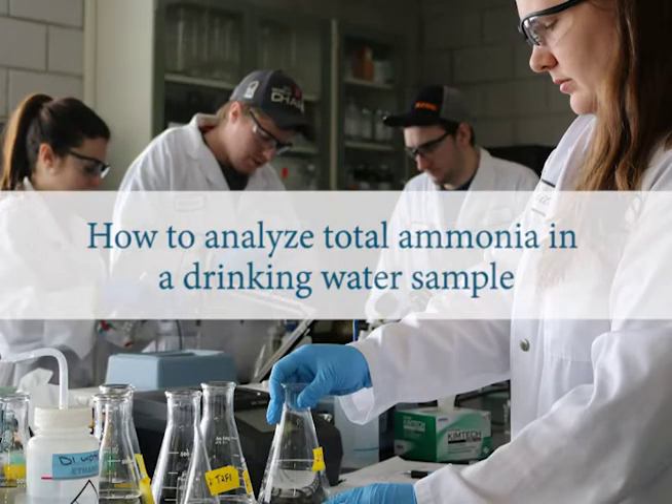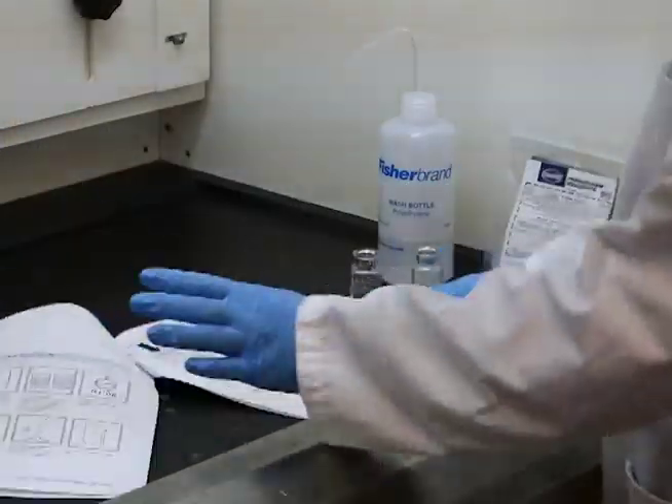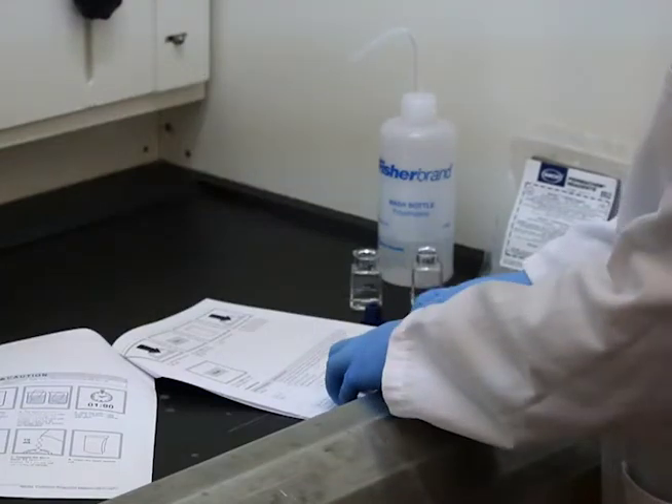This video will demonstrate how to properly analyze total ammonia in a drinking water sample using the salicylate method. This is a basic procedure overview.